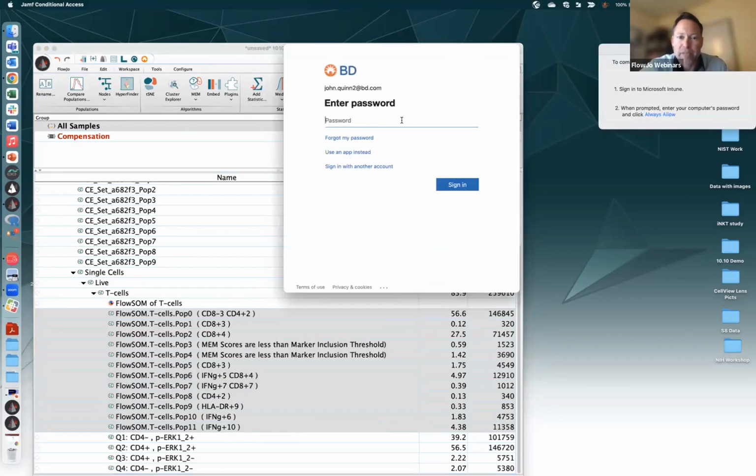No, sorry, BD is going to ask me for a password because why not?